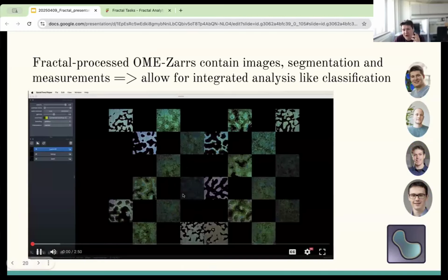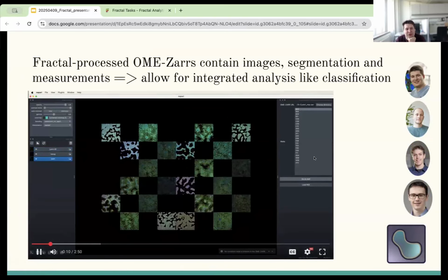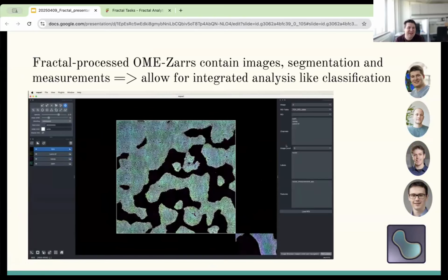The Napari viewer can also visualize a whole plate of our images. So as shown in the beginning, we can browse, and we've built a series of plugins that allow you to navigate these plates, but also to say, given a plate that we have in an OME-Zarr, let's load additional data and correctly overlay it in the right space in the world coordinates.